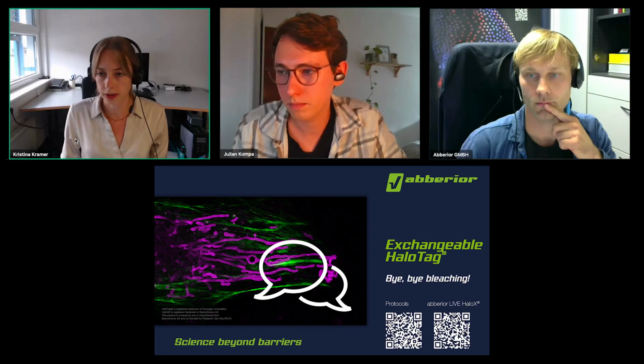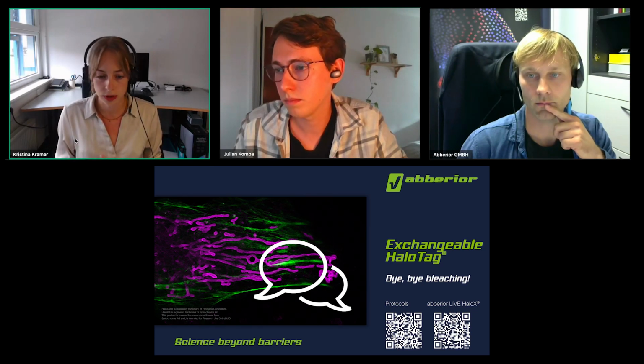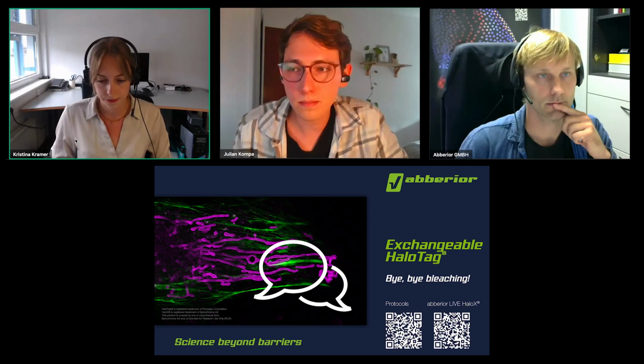Okay, nice. So you talked a lot about the advantages and the nice things about the exchangeable HaloTag, but are there also limitations or technical pitfalls that you can talk about a bit compared to the covalent version?